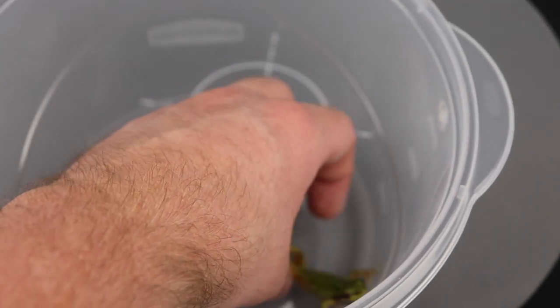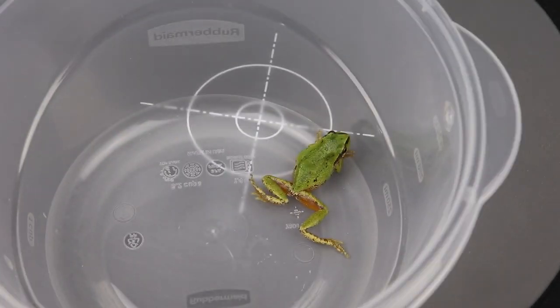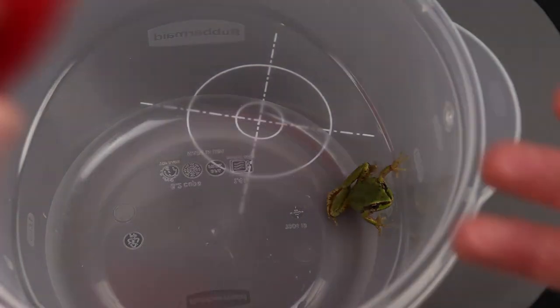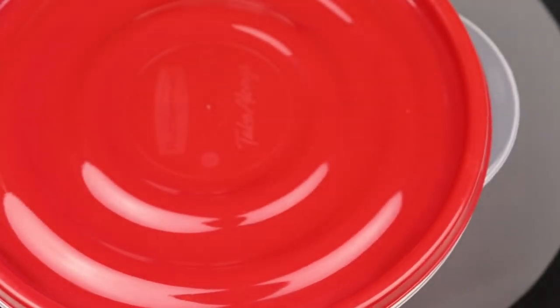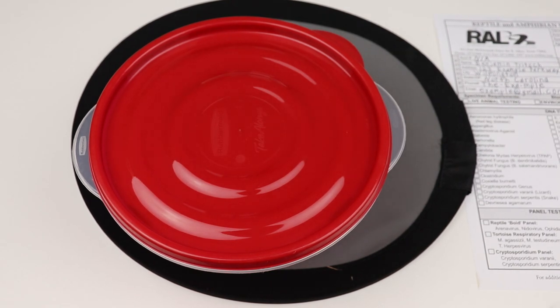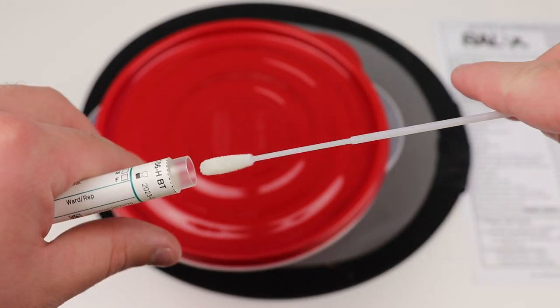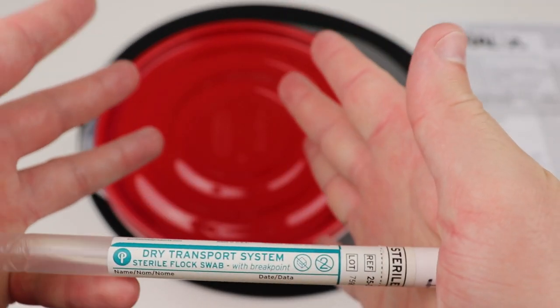That's all you really need to do. The frog is certainly stressed but fine — I've taken some moisture off his skin but he'll de-stress and recalibrate. Put the lid back on the tub. Once you have a thorough swab — the standard is 15 times on each side, though I normally do more — put your swab back in the tube.